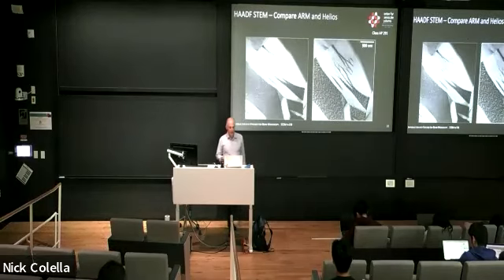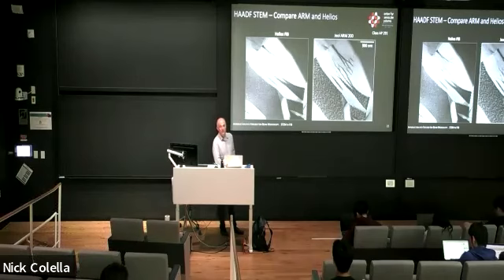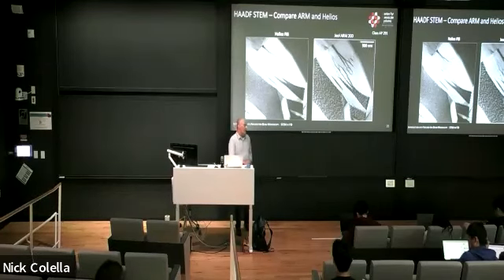And then in the end, we can see TEM images. Incidentally, we do have a scanning transmission electron microscope in the Helios itself. And so you can see here a comparison of the TEM image that we recorded with the Helios and the one with our atomic resolution microscope. And you can see on the nanoscale, it produces similar results. Of course, with the Helios, we cannot go down to atomic level, right?